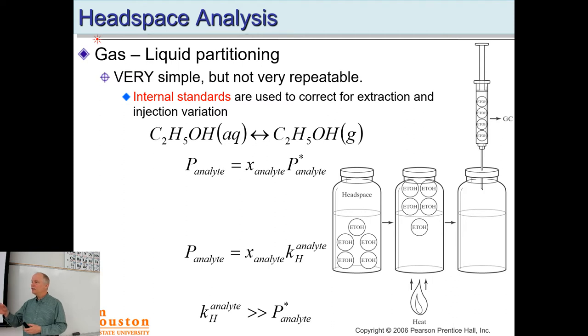But we would take those liquid samples, and as soon as we made it acidic, all of those fatty acid compounds would be protonated, and now they're neutral. They really don't want to be in water, and they're small enough molecules that they come out the top. So it was dramatic. One or two drops of acetic acid into that solution would be enough for the smell to just go through the roof, because that's where a lot of the smelly compounds are, those fatty acids. I mean, it was dramatic. And so your nose was the detector in that case.